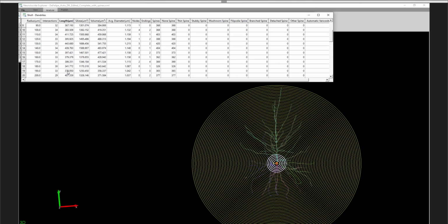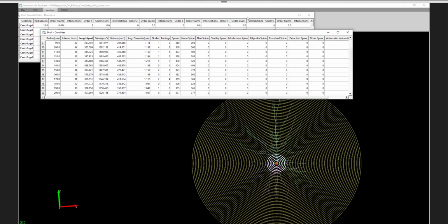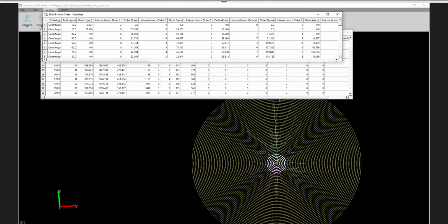So there's a lot of data that we can generate right from here. It's really powerful data to be able to present and move forward with, so that's always very exciting to show people. And the nice thing about this as well is if you're working with data files that have multiple cells, this isn't restricted to one cell.